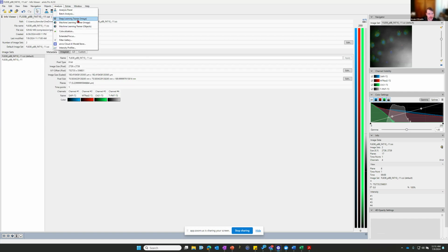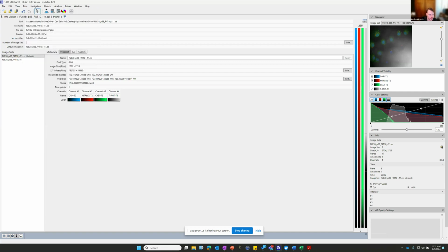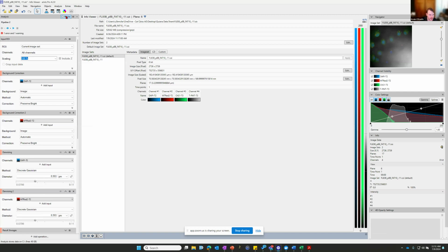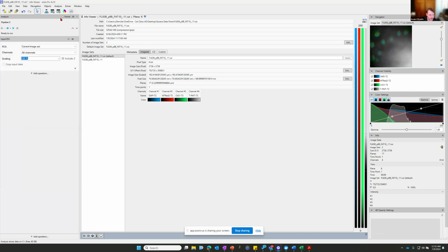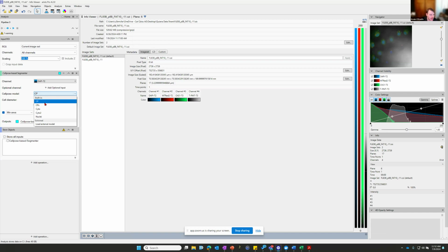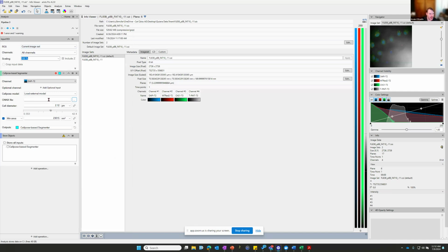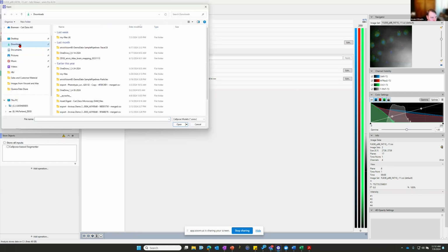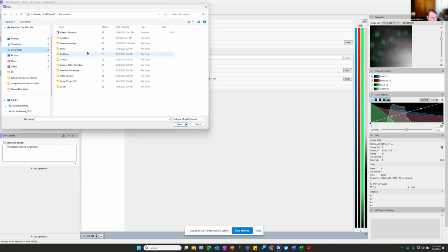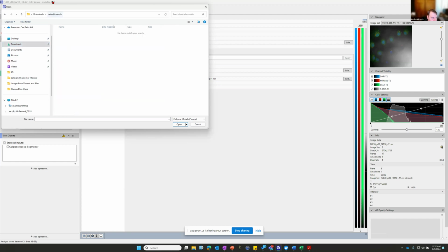And then alternatively, let's say you don't want to use the deep learning trainer here, and you want to go with the Cellpose route, like a custom Cellpose route. The way that we can do that is, I start a new one. We can do this load external model. There's a file, these ONNX files, we can load them, and maybe I have one already. Let me see. I do not have an ONNX file. Unless it's in here.